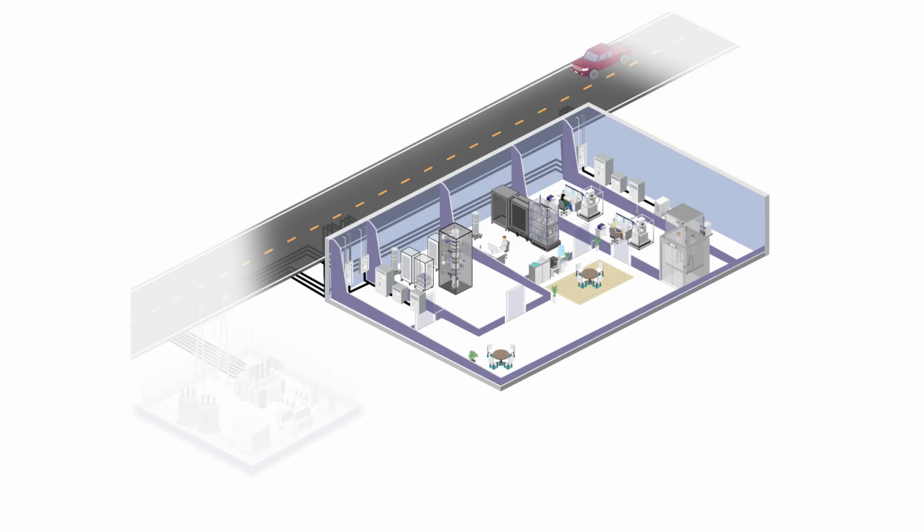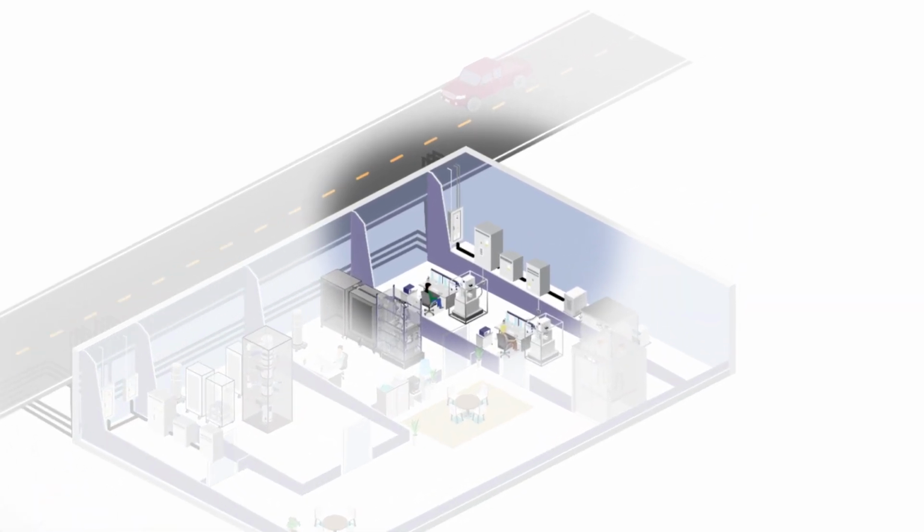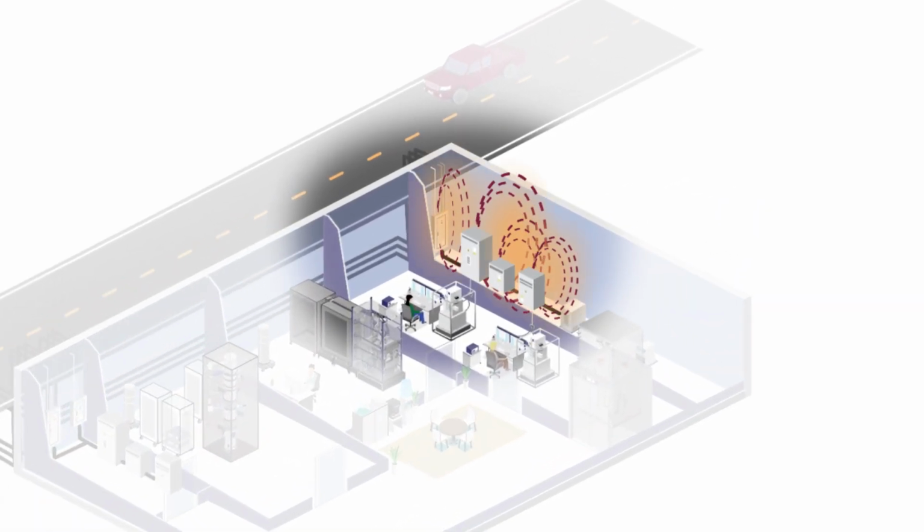So looking at AC magnetic field sources outside the lab, outside the room, you have several sources which are obvious, right? You have the electrical rooms, which have branch panels, distribution panels, transformers, switch gears, etc. We've already talked that these are high magnetic field sources, particularly when they have high loads and therefore high current. Obviously, you don't want to put a sensitive TEM right next to an electrical room.